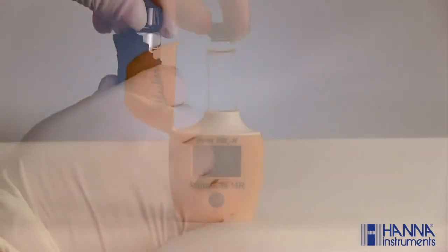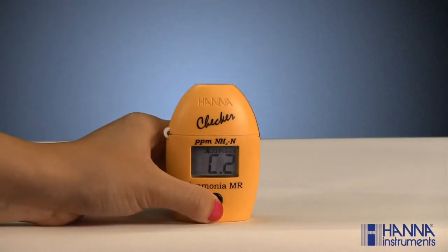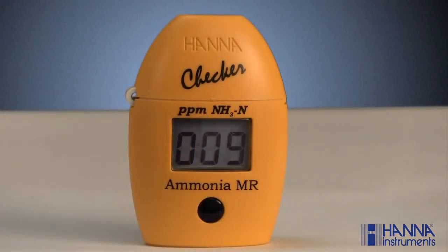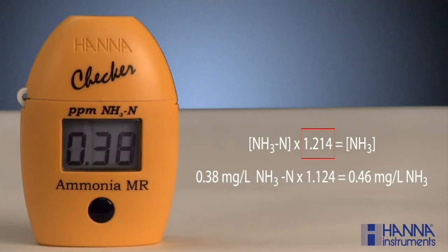Wipe and index the cuvette back into the checker and close the cover. Press and hold the button until the timer is displayed on the LCD. For the ammonia test, the reagents take 3 minutes and 30 seconds to completely react. When the timer reaches zero, the checker will read the absorbance and the results will be displayed in milligrams per liter or parts per million ammonia nitrogen. To convert the reading to ammonia, multiply by a factor of 1.214.